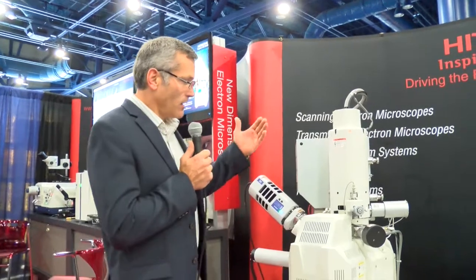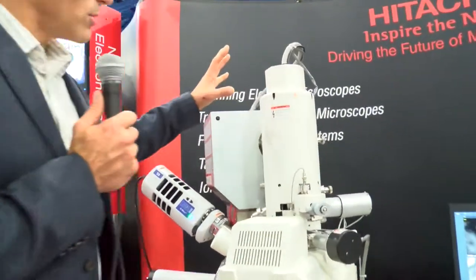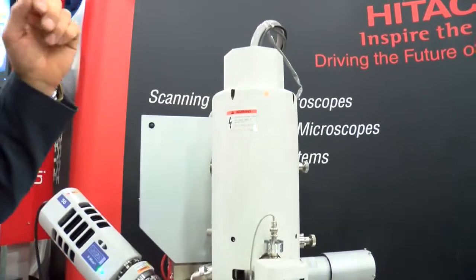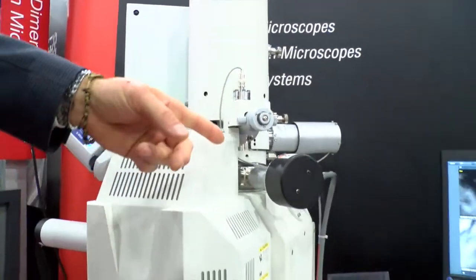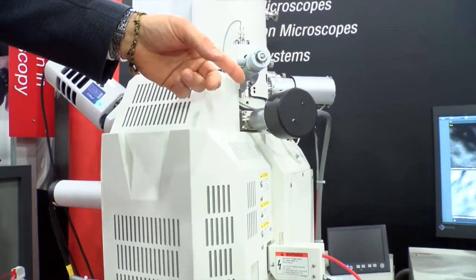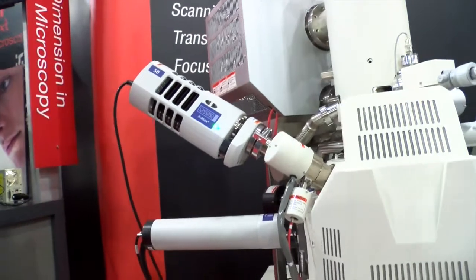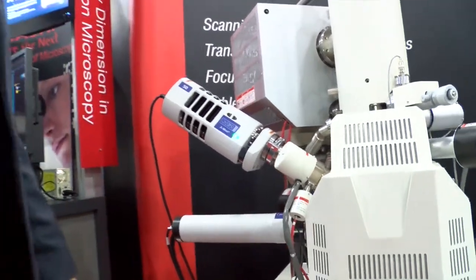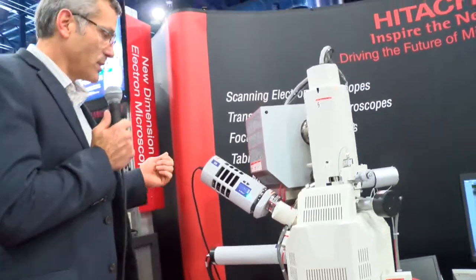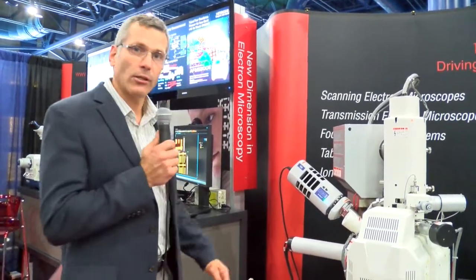If you look here on the microscope, we have a Schottky electron source. It also has a censored aperture. And we also have an inline secondary electron detector — this is our new UVD variable pressure detector, which allows you to do SE-like imaging in low vacuum. The system has 11 total ports with four analytical high-angle ports.